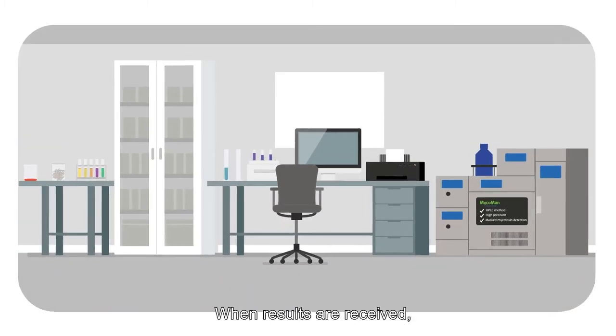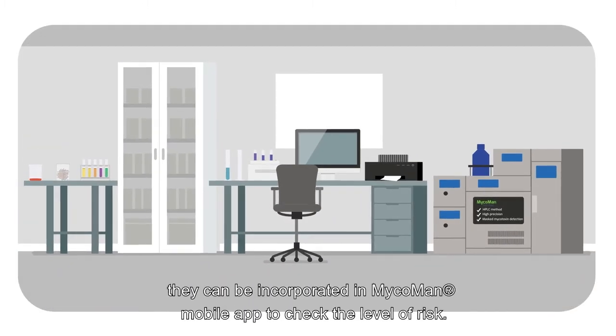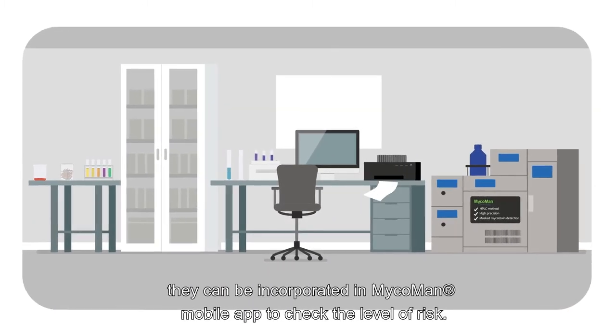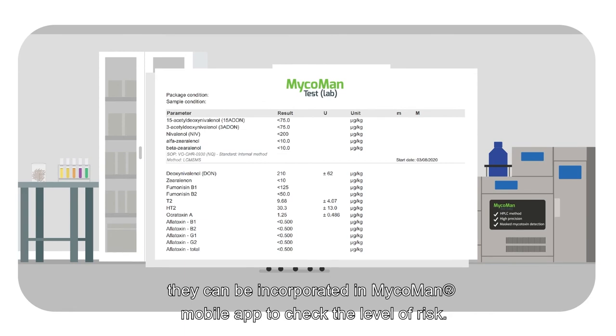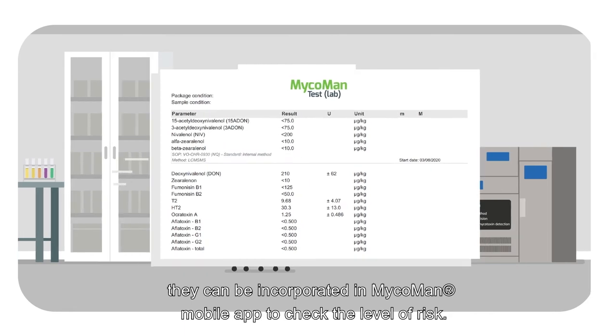When results are received, they can be incorporated in Mycoman mobile app to check the level of risk.